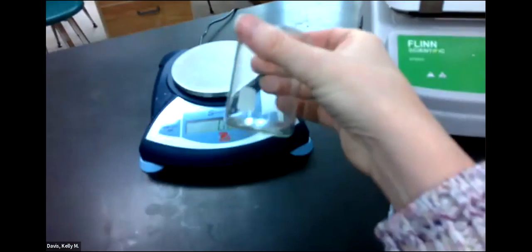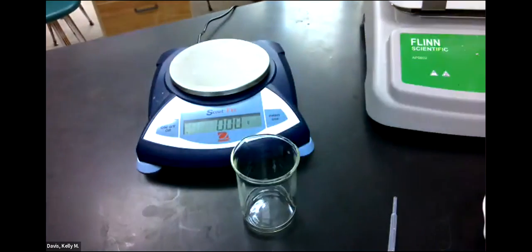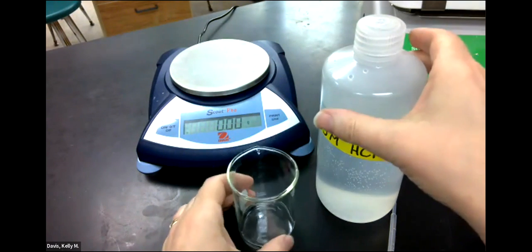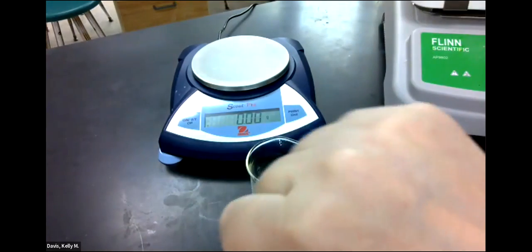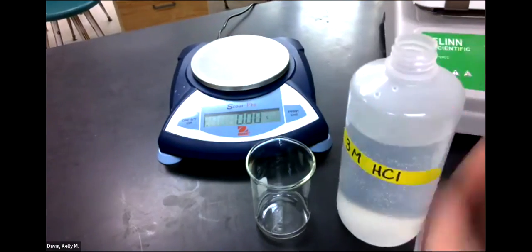So the magnesium is in the beaker. I'm going to set it here, and to that, I'm going to add hydrochloric acid. I don't want to add any extra acid, so I'm going to add the acid fairly slowly. It's going to bubble. It's going to get really hot. I'm going to add it slowly, and I want to stop adding as soon as all the magnesium has reacted. So I'm going to go pretty slow here.